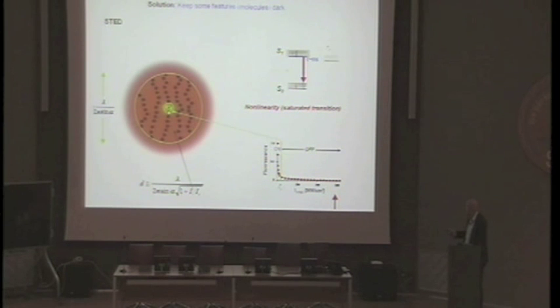Now, if some of you have a physics background, you will say that what is actually done here is a so-called nonlinear transition, or a saturated transition, going from on to off, and you can call this a nonlinearity. That's correct. It's not wrong, but it doesn't get you to the point. For those who want to really understand the point, and that's the gist of the whole story, in fact of the whole super-resolution field, we prepare the molecules in two different states.